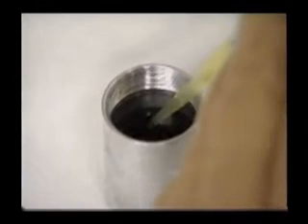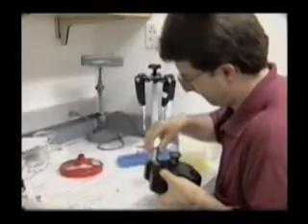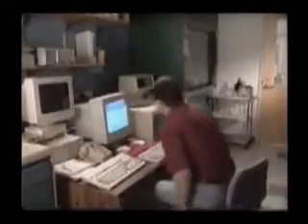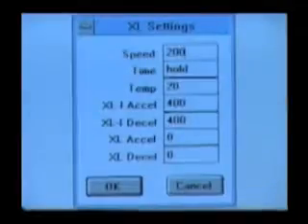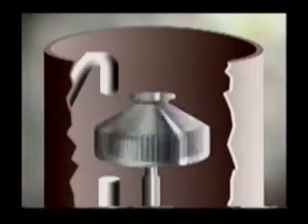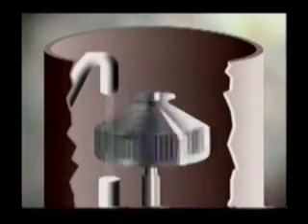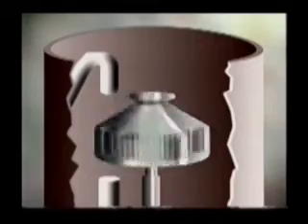We'll run an experiment to measure the average molecular weight in samples of mixed STF and 7A. Three samples, each with a different concentration of protein, are loaded into chambers in a cell. The rotor is set to spin at 20,000 RPM for about 10 hours. At this low speed, particle sedimentation is counterbalanced by particle diffusion in the opposite direction. What we achieve is called Sedimentation Equilibrium, a smooth gradient of protein running from low concentration to high.